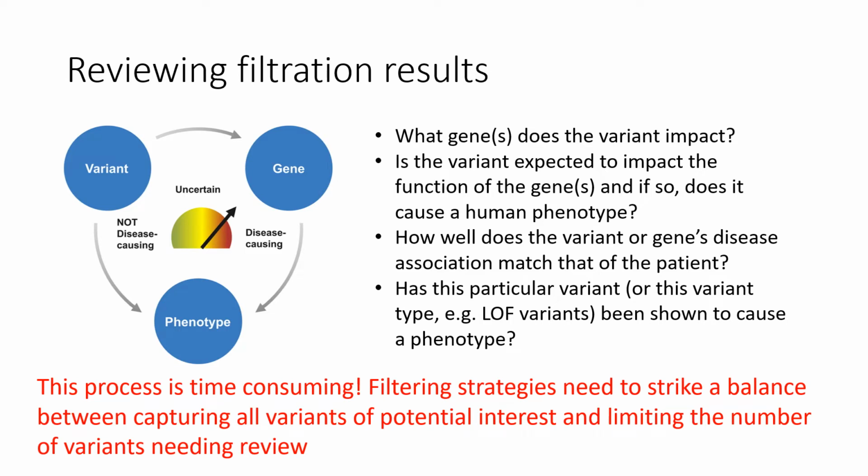And this is a fairly time-consuming process. So the ultimate goal of your filtering strategy needs to be striking a balance between capturing all the variants that might be potentially interesting to your patient, but also limiting the number of variants that need this very time-consuming manual review.